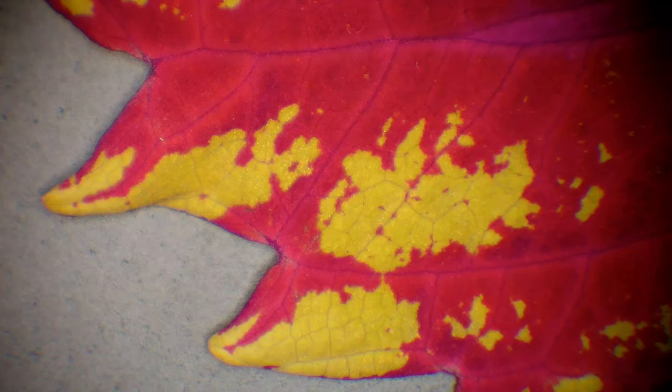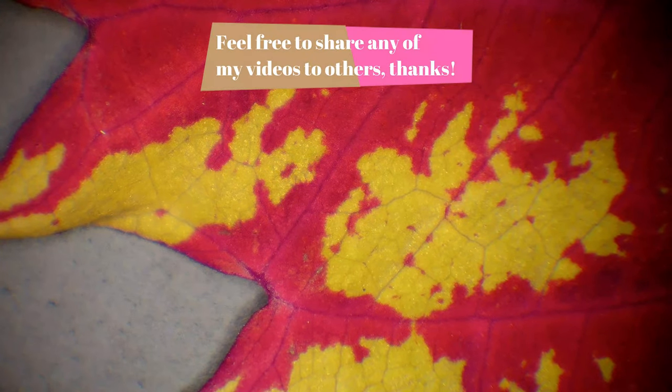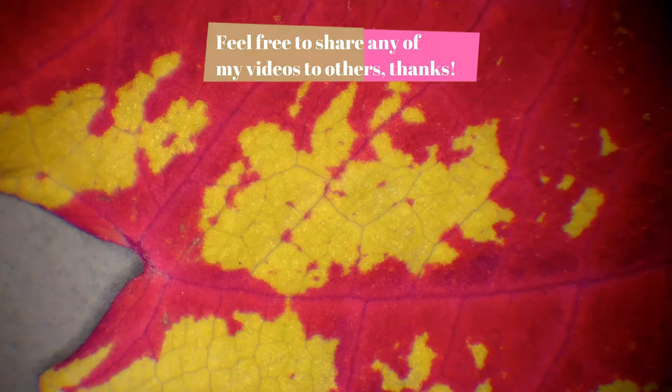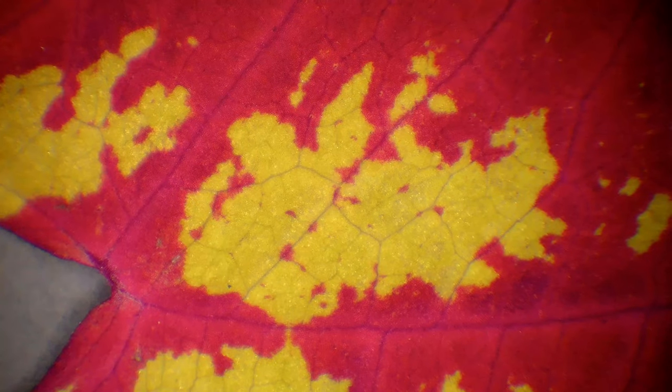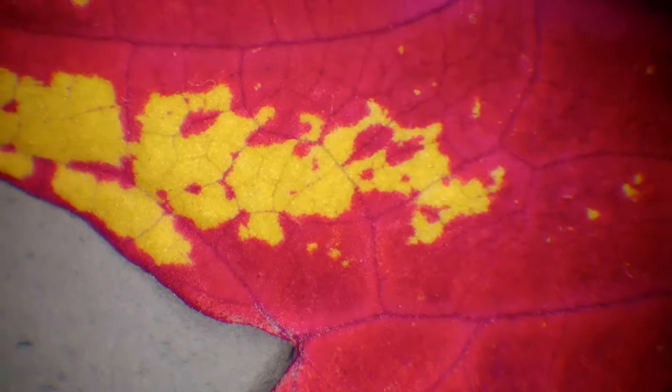I will try to get us through the zoom in of the leaf quite quickly. I will be fast forwarding a little here. I like this kind of plant because it feels like it's very easy to grow.